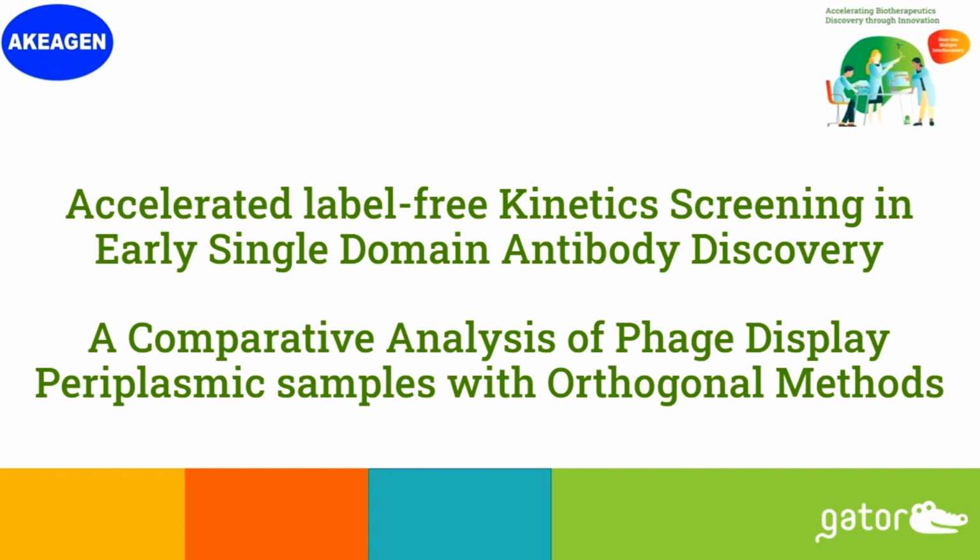Good morning, everyone. I'm Indrani here at Gator Bio, and today we will be talking with our collaborator, Dr. Libin Cui. He's the CEO and the founder of the company Akeagen. And recently we completed a collaboration where we screened 1,000 plus periplasmic solutions that were obtained from his KM mouse platform. And the topic of today's discussion is accelerated label-free kinetic screening in early single-domain antibody discovery.